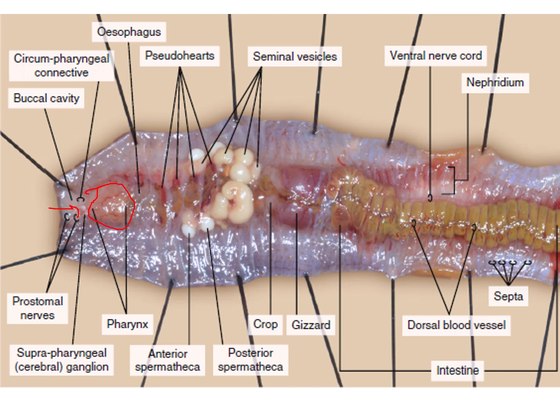They are called calciferous gland or Morren's gland on either side of the esophagus. So these glands could be in three pairs. Here they are not visible. These glands help to remove excess calcium and carbonate from the blood that comes from the soil that is ingested by the earthworm.